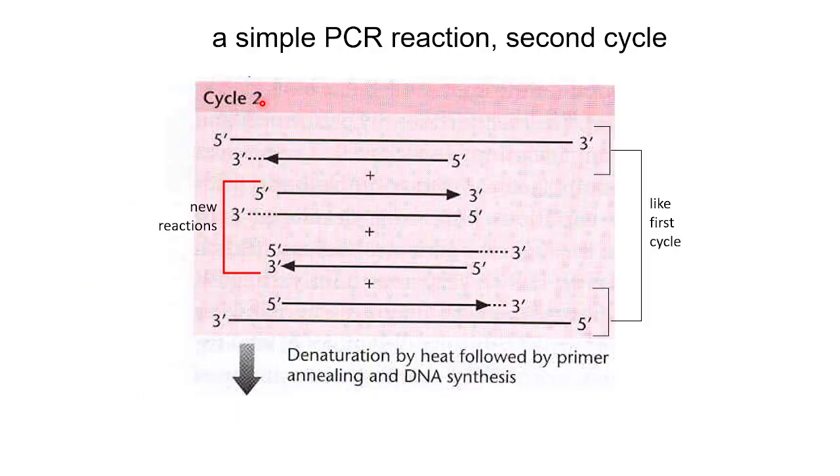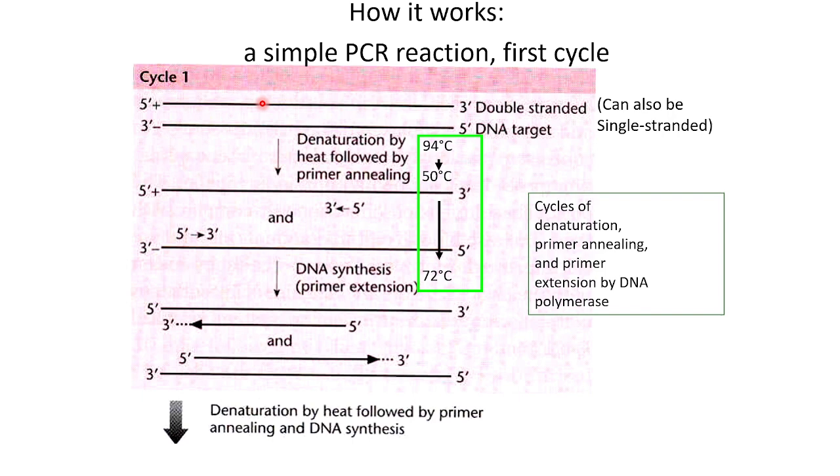What you need to remember from here is that the denaturation occurs at a very high temperature. So I'm telling how we do a PCR. Say you are setting up a 50 microliter reaction mixture. First you know the template DNA concentration.